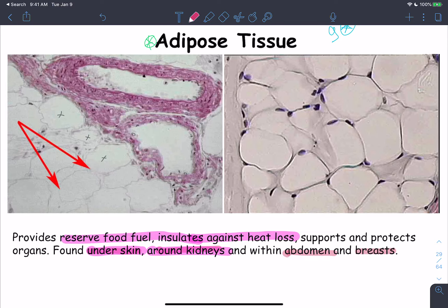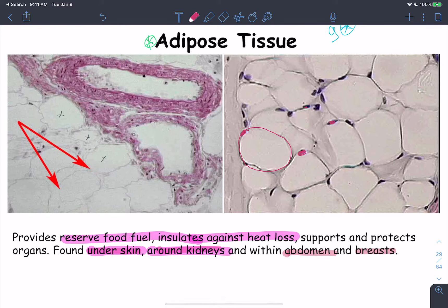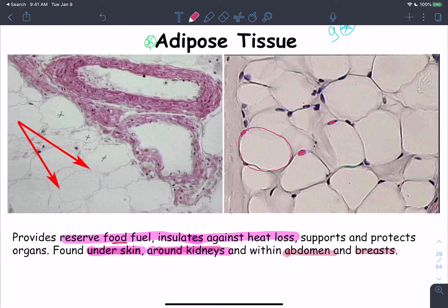The adipose connective tissue features large, empty, vacuolated cells with nuclei compressed toward the peripheral parts — these are the fat cells. They occupy most of the adipose tissue. The main function of adipose connective tissue is to reserve energy in the form of fat; extra energy intake is transformed into glycogen in the liver and skeletal muscle cells, or as triglycerides and neutral fat in the adipose tissue cells.